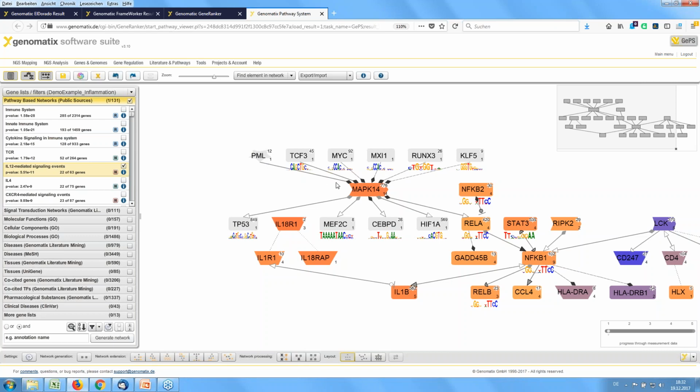This cofactor obviously binds in the promoter of MapK14 as shown by this black arrowhead, and this is also included in our network here. You see that some of the other transcription factors have just an in silico binding site, and others have a validated binding site. And this one can have only a validated binding site because we have no definition for an in silico binding site for this factor.